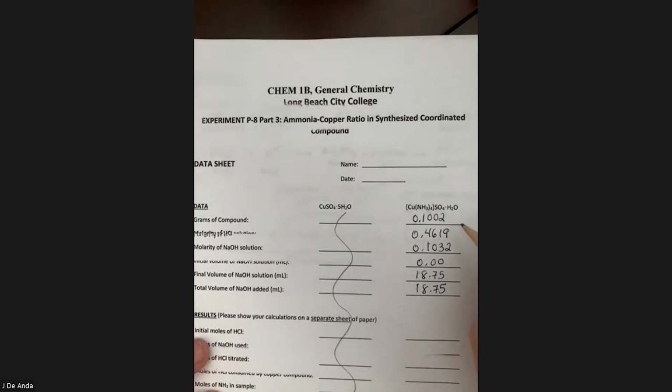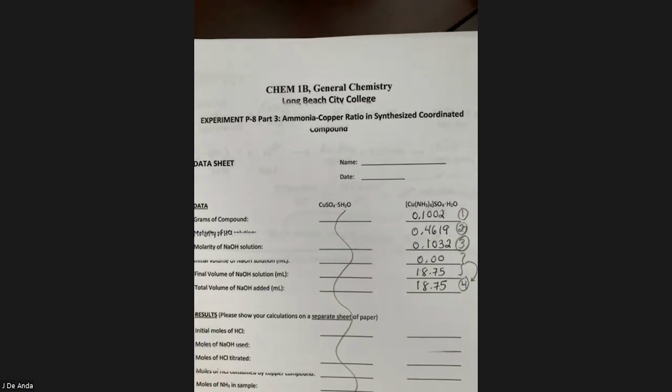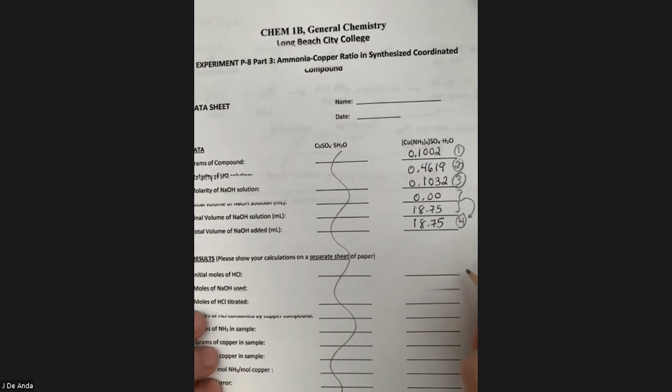So I'm going to go ahead and put numbers here. This will be 1. This will be 2. Sorry, my printer was a little messed up. So this is the molarity of the HCl. This is the molarity of the NaOH. And these are the initial and final volumes. I'm just going to skip that over here and call this number 4. Normally it would be final minus initial, but I started at 0.00, so it's a trivial calculation. So we're going to have to find out what were the initial moles of HCl. We're going to call that number 5. We're going to go here numbering all these different rows, 8, 9, 10, 11, 12, and a lucky 13.